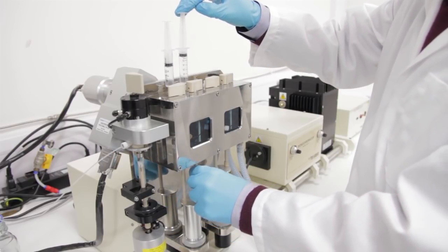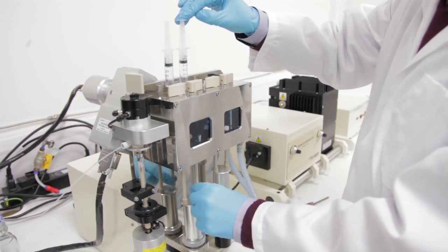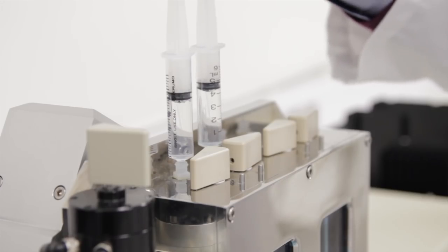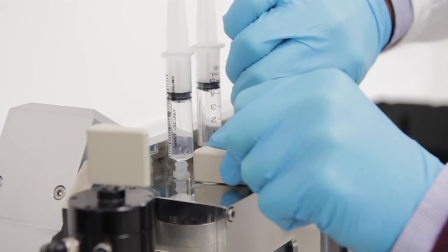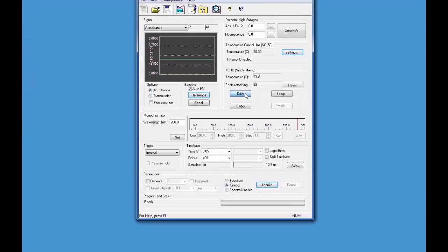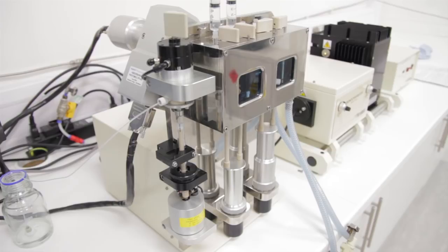Fill the drive syringes with your background solution and avoid introducing bubbles. Then set the drive valves to the drive position and click the drive button several times. This will push the old contents out of the cell and fill it with the background solution.